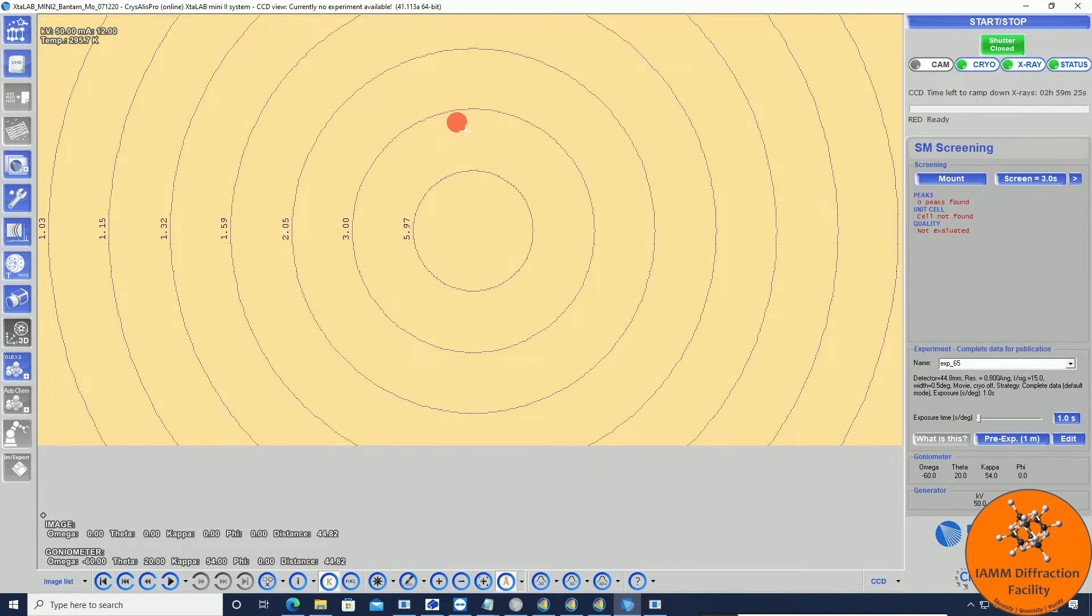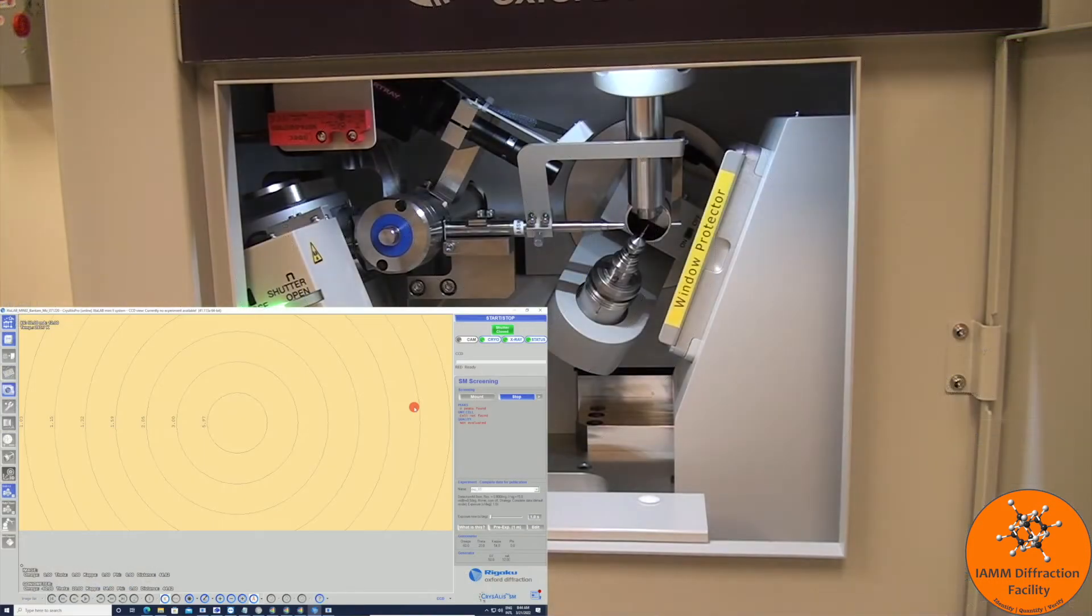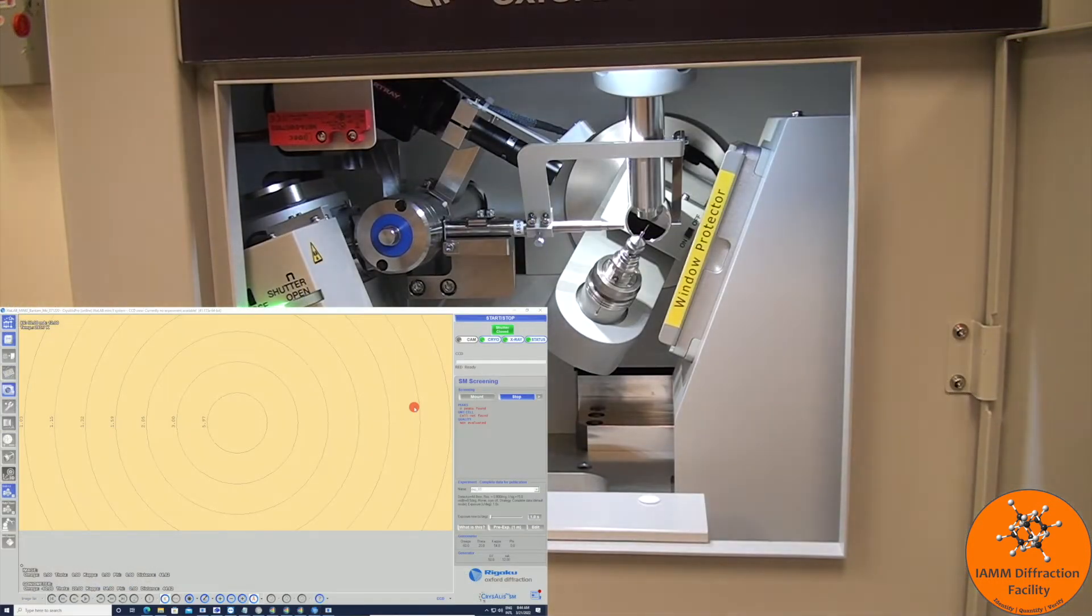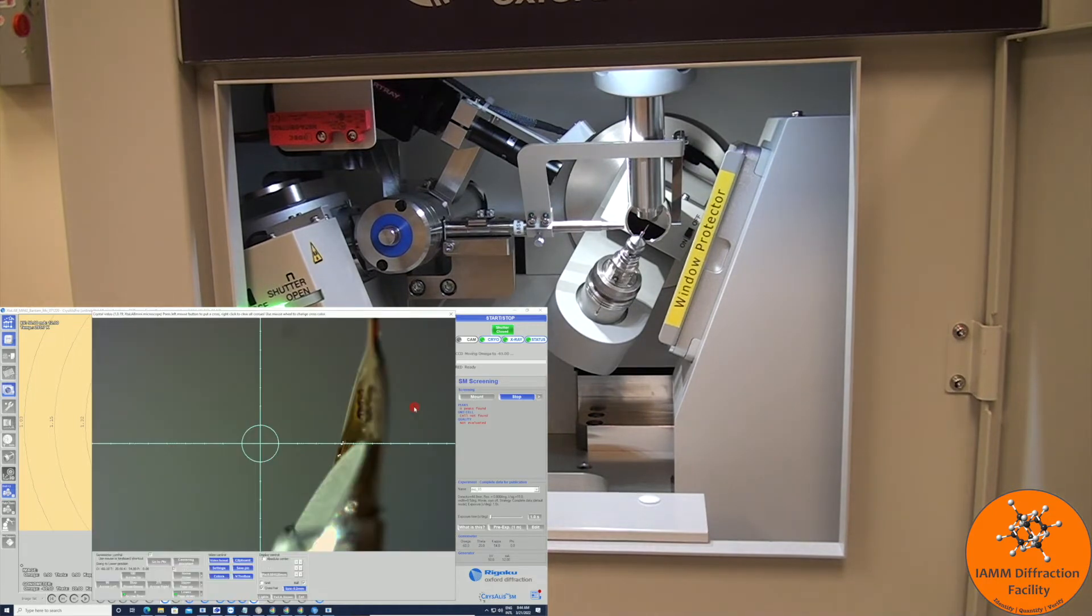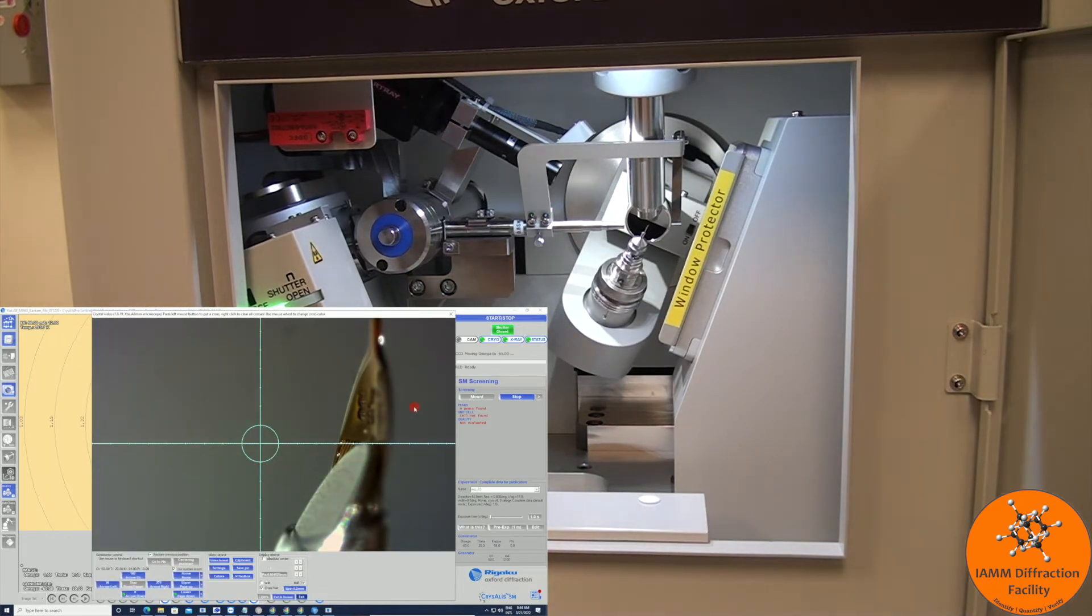In order to make sure that the sample is aligned in the x-ray beam, we can either click this mount button here, or we can hit F12 on the keyboard.